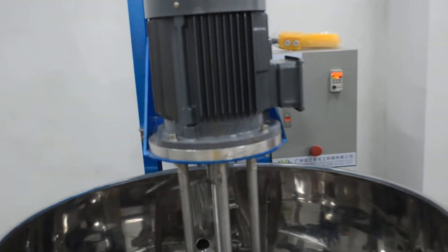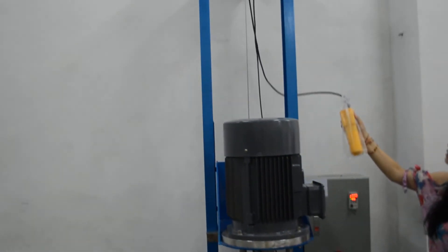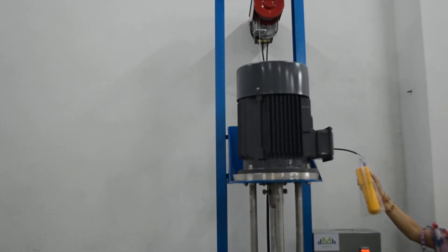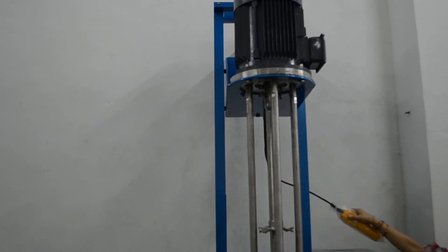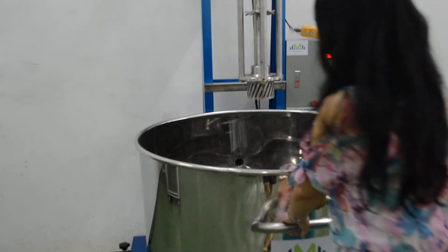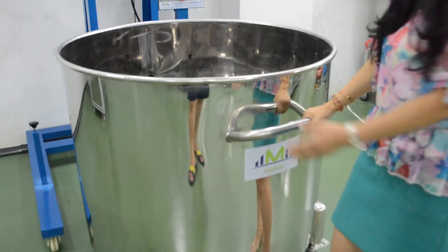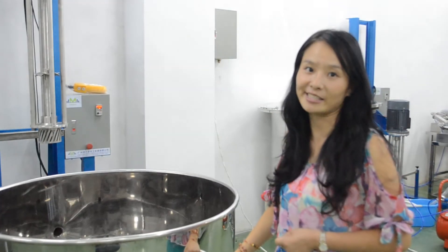After mixing the material, we're going to lift up the machine. Then move this door tight or out. Move to the finish machine for finish. That's it.